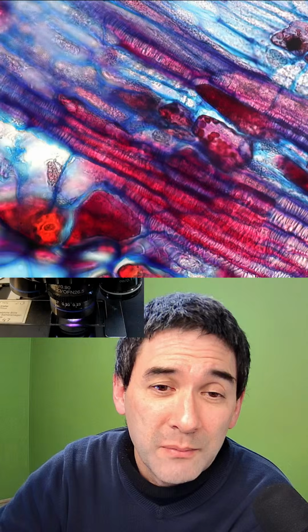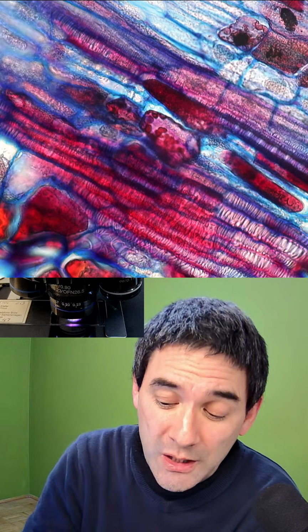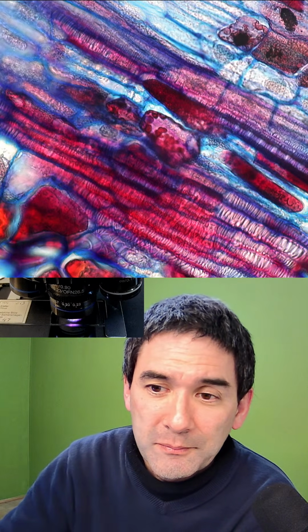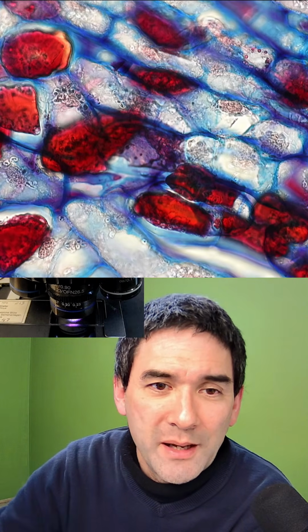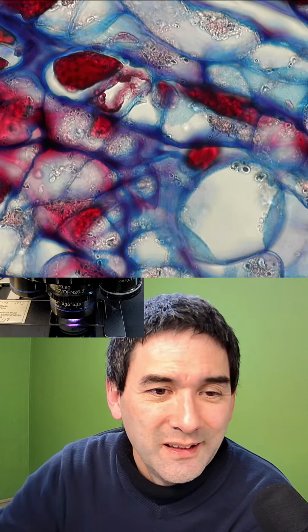Sometimes when I make my slide rings, I don't use a brush, but I actually use a pipette. So this is basically again also one of my favorite slides here.